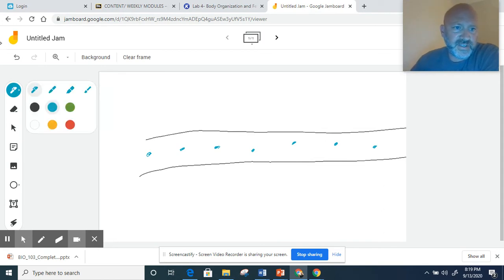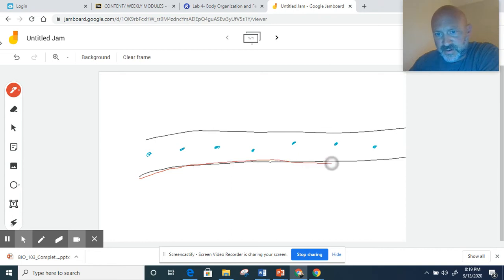So, of course, in the intestines, there's a lot of blood. There's a lot of blood vessels down in there because this is where the blood goes and picks up nutrients. We need nutrients in our blood, right? That's an important part of making energy and whatnot, right? So you got a lot of blood vessels down there. So the idea is, how do we get these food nutrients from the intestines into the blood? Well, it's not a smooth surface like this inside the intestines.